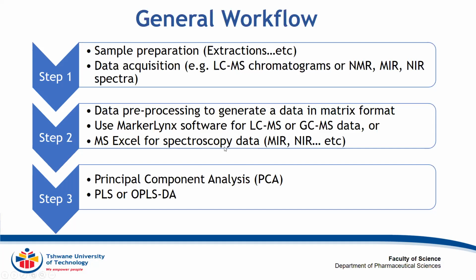And then in terms of spectroscopy data, the spectra are just exported from say OPUS or NIRCal, and then you put them into Microsoft Excel, and then you're able to generate your data matrix. And then you can add more information depending on the kind of objective that you want to achieve before you actually export the data into the software.